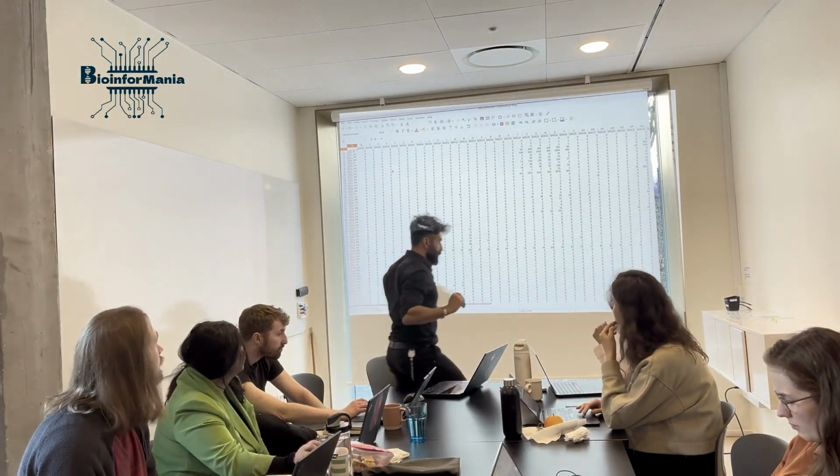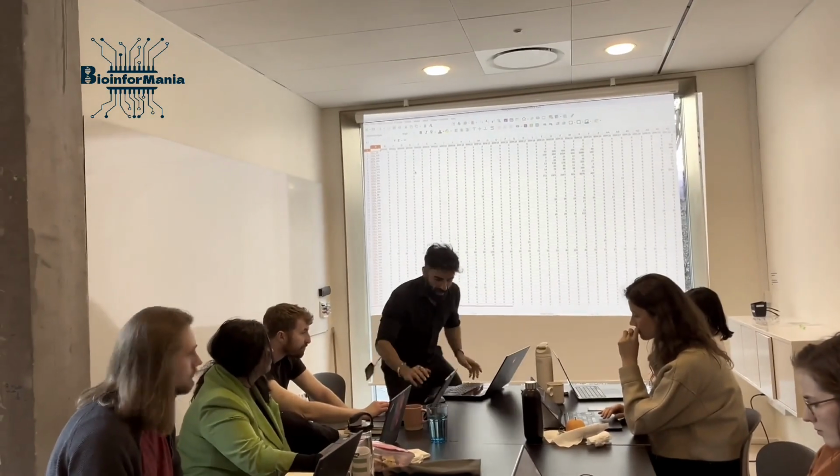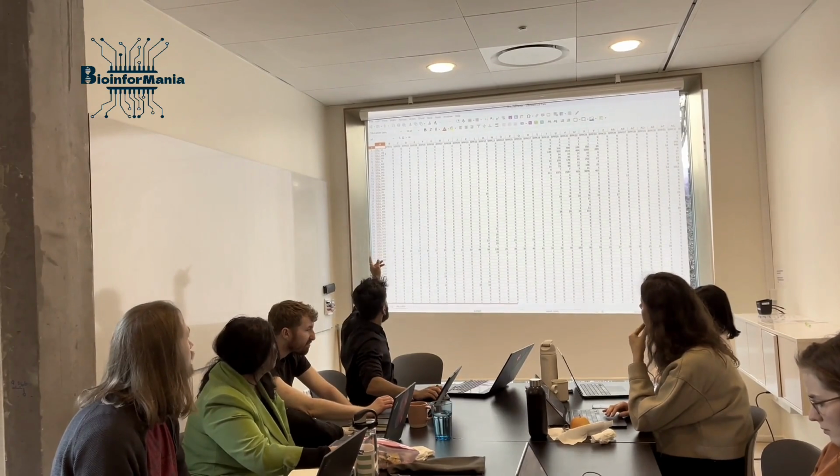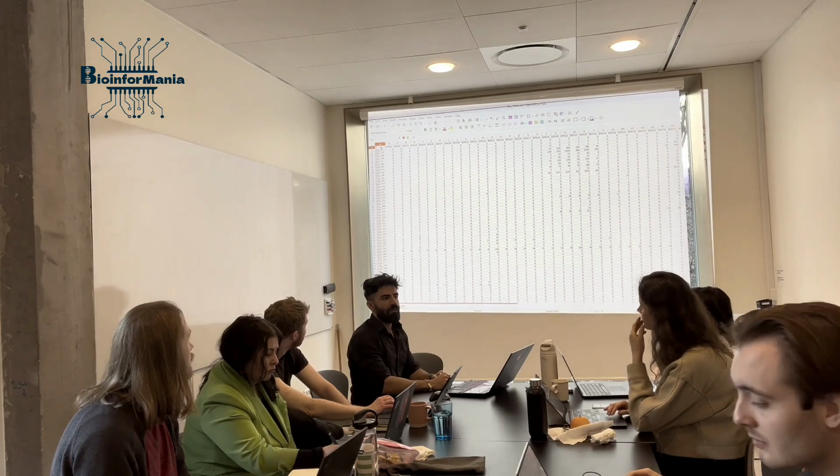And then when you have your own data, okay? Your own data should look exactly like this. At the top here, this shouldn't be empty. It needs to have a name. Let's call it ID. Anything.